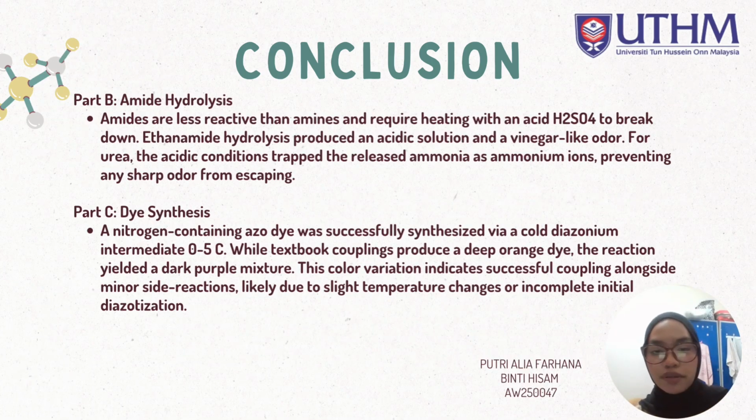Part B is amide hydrolysis. The conclusion is that amides are less reactive than amines and require heating with H2SO4 to break down. Ethanamide hydrolysis produces an acidic solution and a vinegar-like odor. For urea, the acidic condition traps the released ammonia as ammonium ions, preventing any sharp odor from escaping.